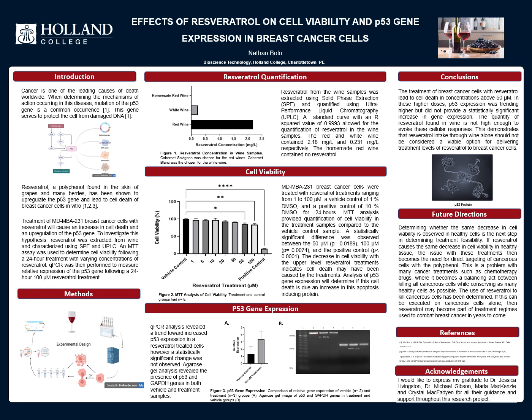Resveratrol concentrations in wine samples can be seen in Figure 1. Red and white wine contained 2.18 and 0.231 milligrams per liter of resveratrol respectively. The homemade red wine sample contained no resveratrol. The variability of concentrations is due to different production methods of the wine. Red wine fermentation occurs with the grape skin on, while the skin is removed during white wine production.